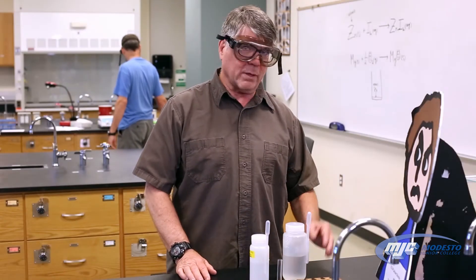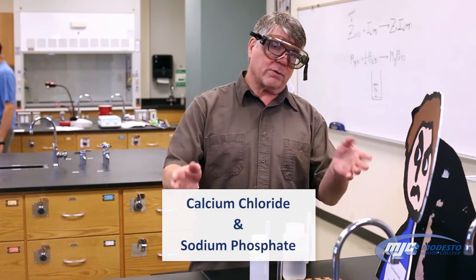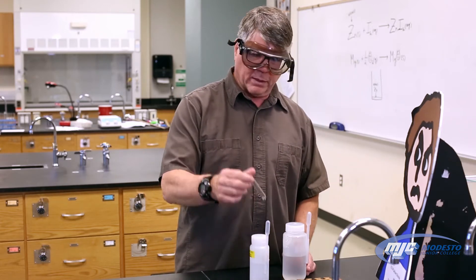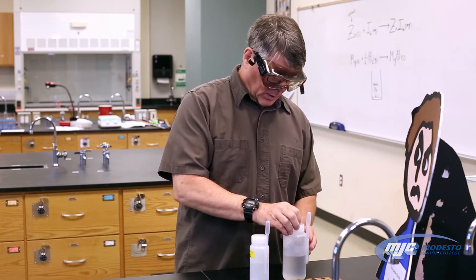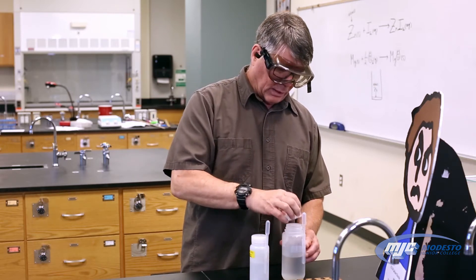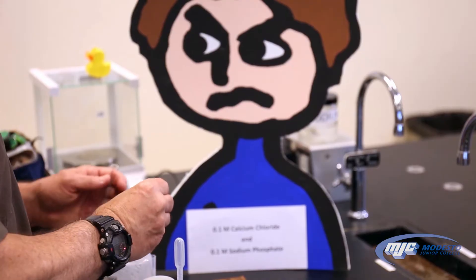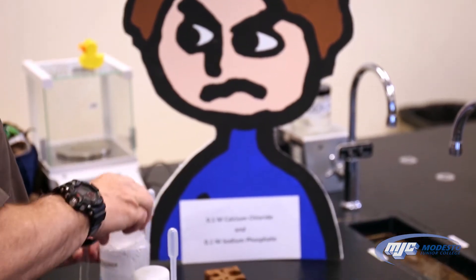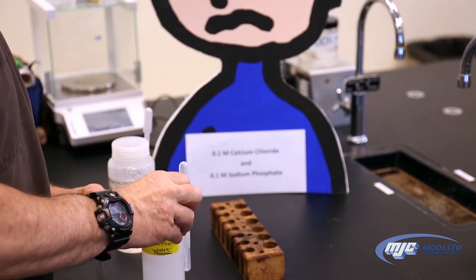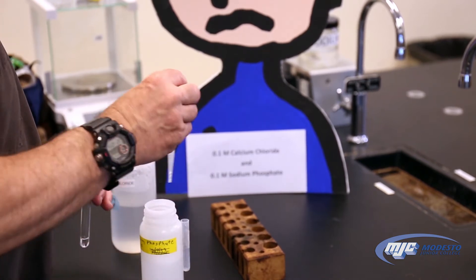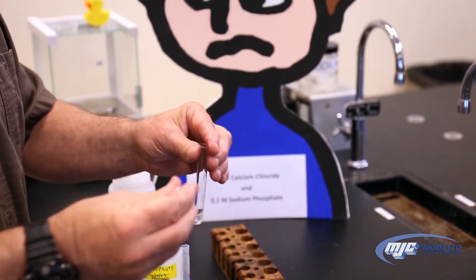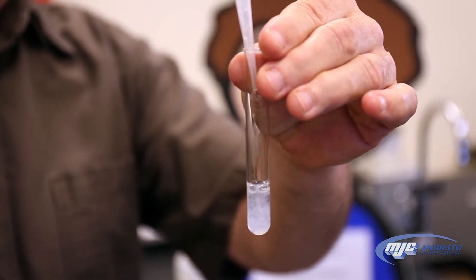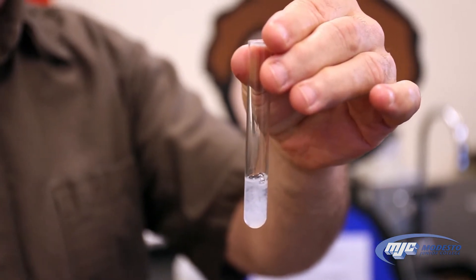This is the reaction, if any, between calcium chloride and sodium phosphate. With all these reactions, we're not going to measure anything — these are all qualitative, so we're just going to put a little bit of each in. I'll take an empty small test tube, add some calcium chloride, just a little bit. Always put the lids back on containers.